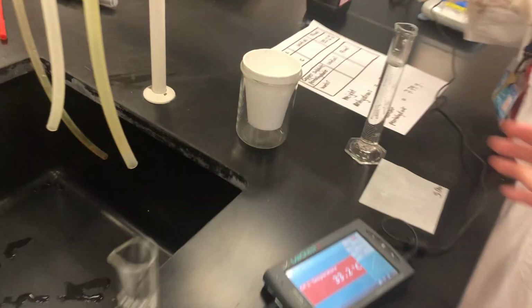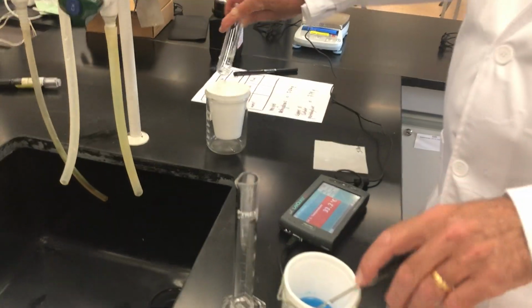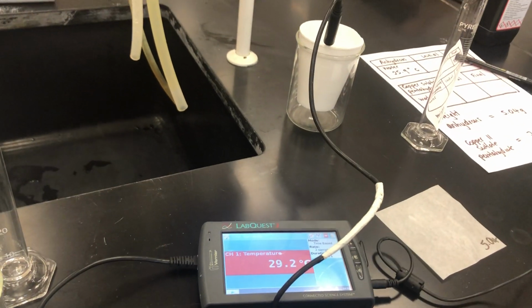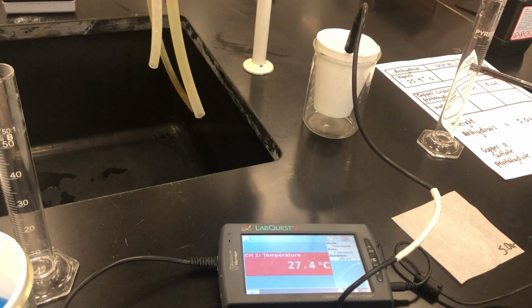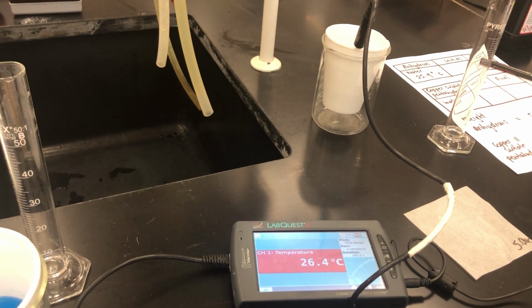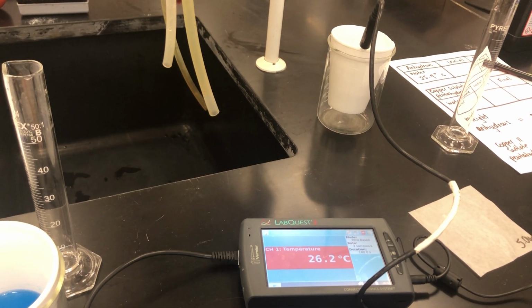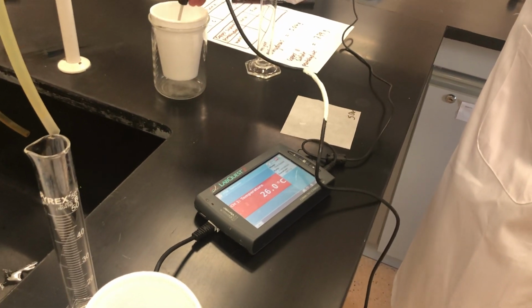Okay. Right. Now we'll repeat the experiment, but with the hydrated salt. So again, we need to get the initial temperature, which will take a little minute to drop back down to air temperature, which was 25.9, so let's just wait until it reaches air temperature.